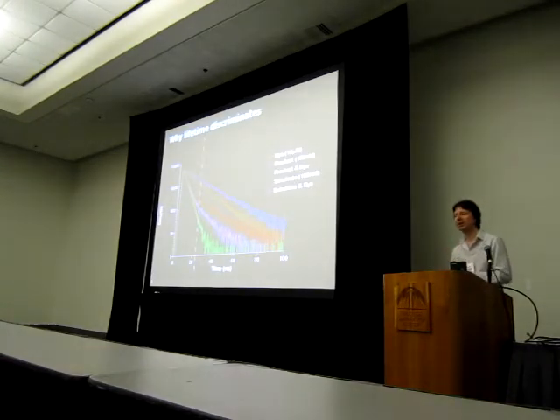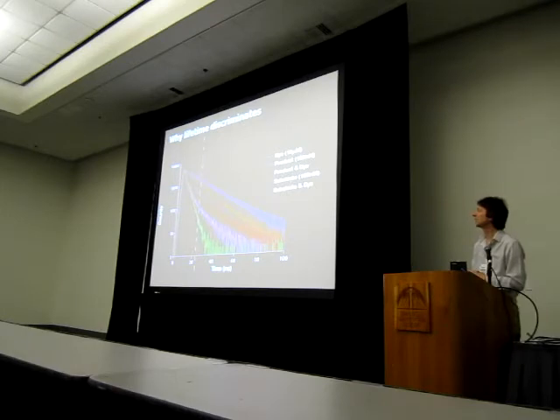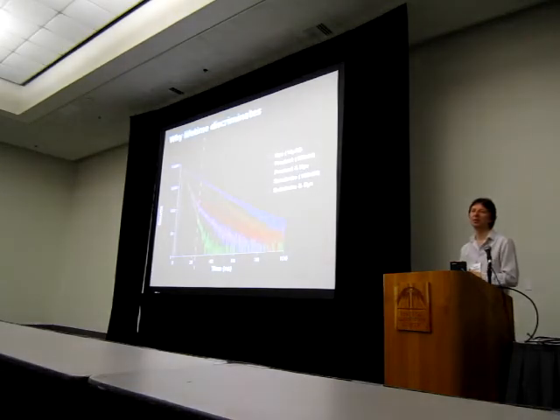One of the simplest ways in which you can apply fluorescence lifetime discrimination is to do something called tail fitting. It involves a little bit of sacrifice of a lot of the signal, but it gives you a signal which is very much more robust and doesn't contain this interfering short fluorescence lifetime signal.